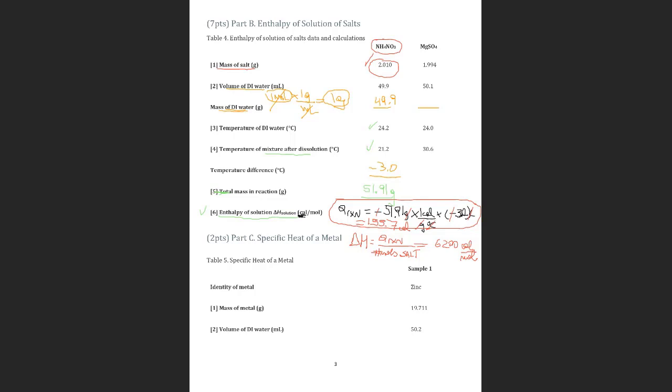Okay, so in order to calculate the Q, you have to calculate the whole thing because that's your experiment. So however many grams you have in that calorimeter, you have to count all that. But then in order to express your result and to compare with the result of other people, everybody will say per mole. And that is kind of standard. So that's why, but that's only at the end.